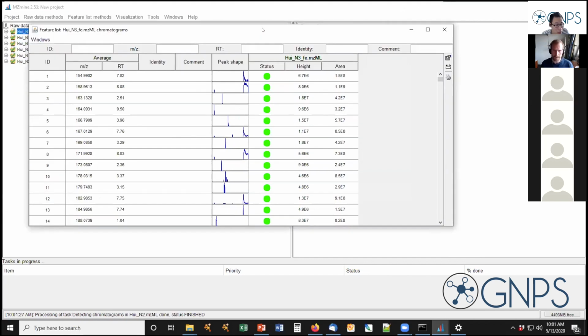The question is, why did you choose a threshold of ADAP higher than the noise level? Because I think a standard definition of a chromatographic peak is that the limit of detection should be around 2 or 3 times the basic noise level. So I just wanted to be a little more strict for the construction of peaks than for the picking of peaks from MS1.